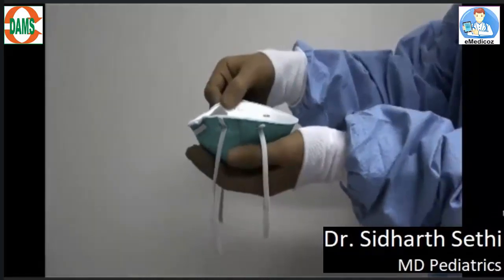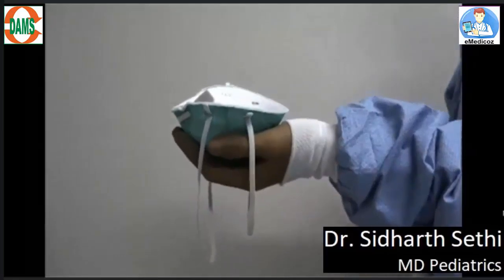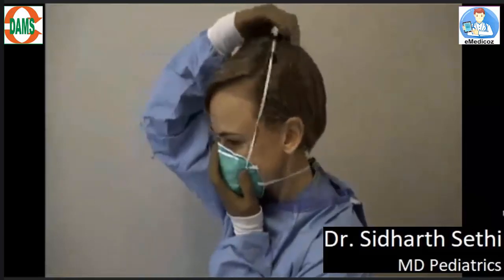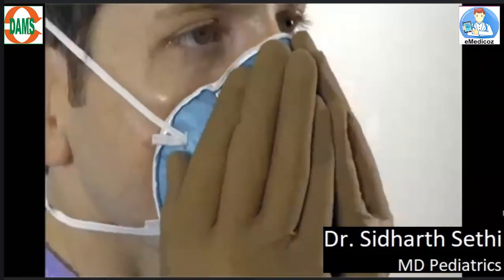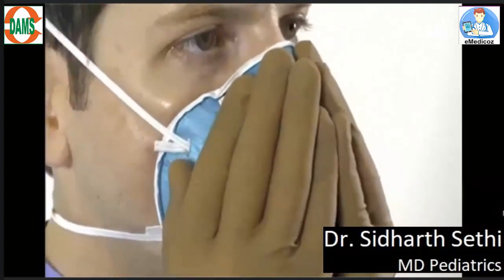Now is the time to put on the respirator. You need to hold the respirator from the outside and then wear it — the lower strap around the back of your neck, and the upper strap on your head. Please check whether the respirator is well and snugly fitted to your nose or not, by breathing in and out.